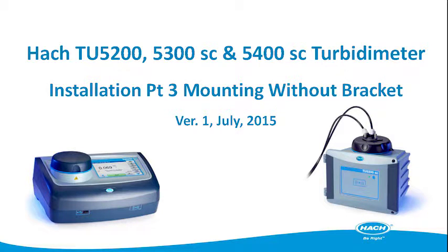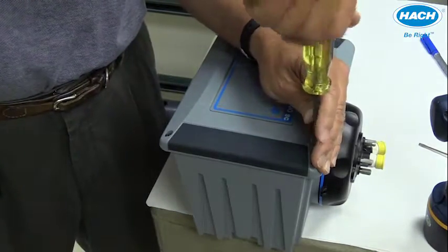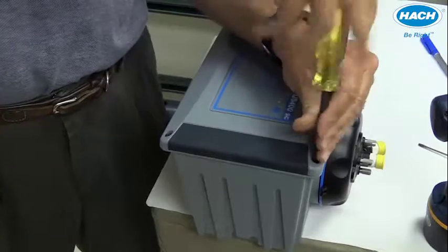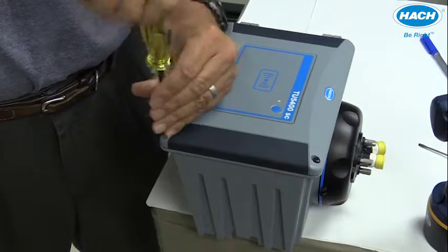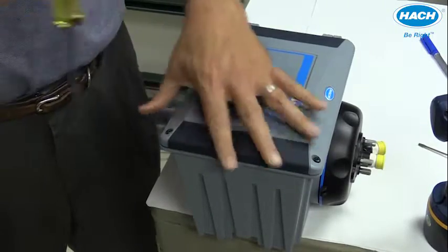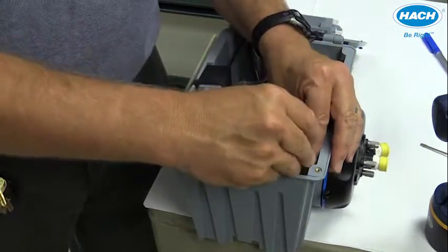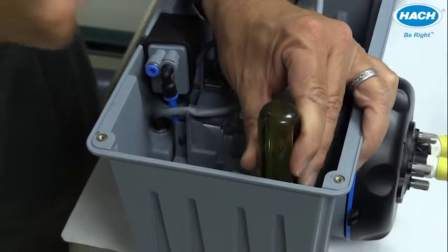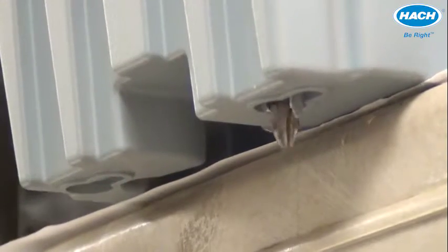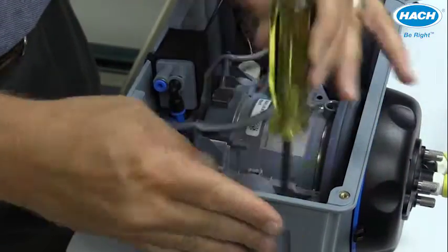If installing the instrument without a bracket, you first need to punch out the covers on the four corner holes of the instrument. To gain access, loosen the two screws on the front of the device. Simply place the screwdriver right over the top of the cover and give it a simple punch — this will cause the material to drop out of place.